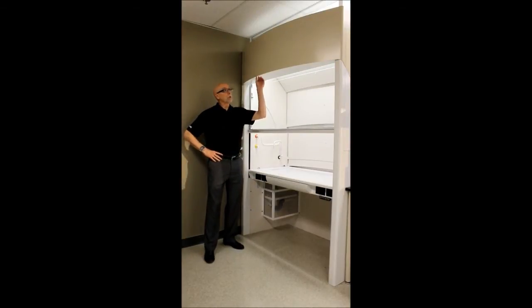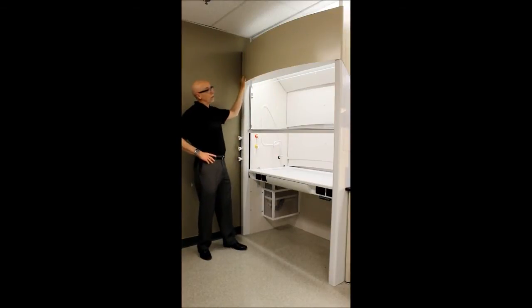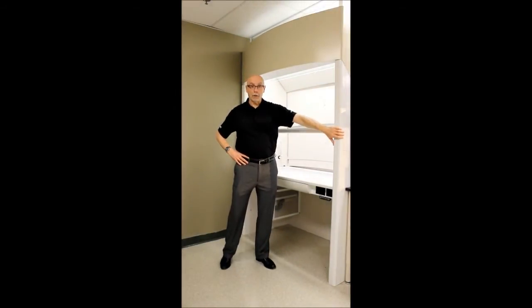What you're looking at is a fume hood that was designed here at Mott to have a few key attributes. Number one is stylish — you'll notice that we have a lot of curves and round profiles on this fume hood.